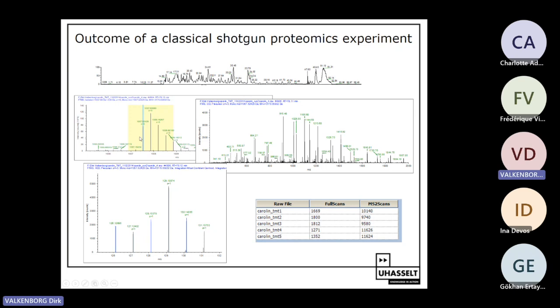What other spectrum do we have here? Here is a zoom-in scan of a precursor. So this is a precursor scan, an MS1 scan, and we look at an isotope distribution in this graph. So we see here a molecular ion eluting from the column, and on the x-axis we have the mass-to-charge ratio, and on the y-axis we have our abundance measure normalized to 100%.